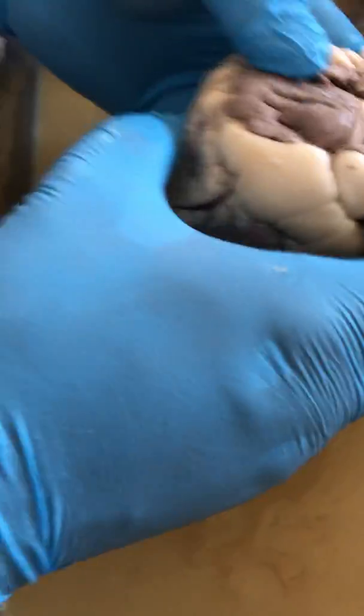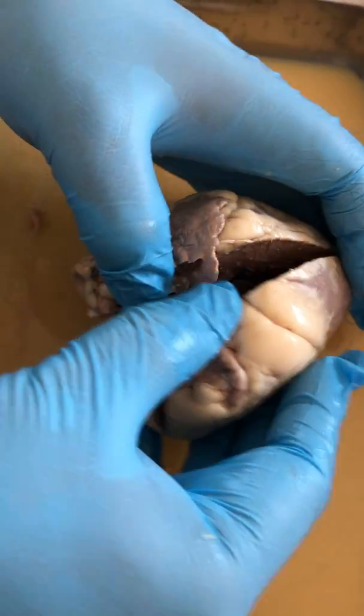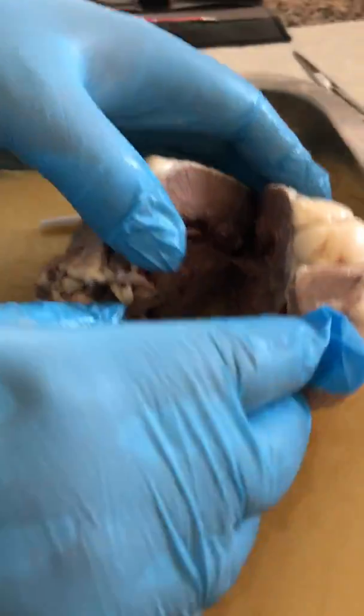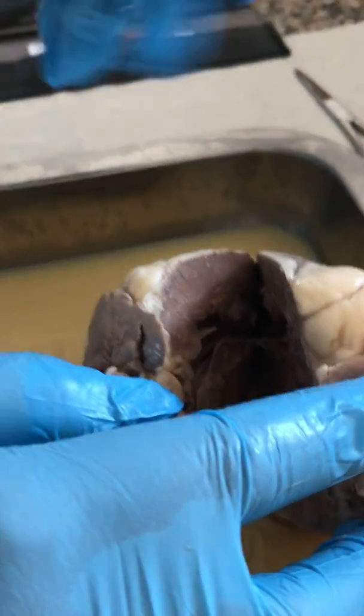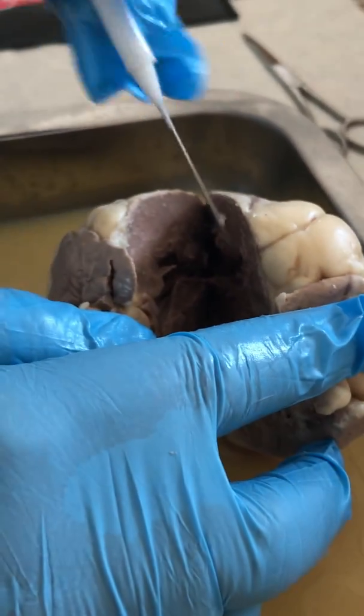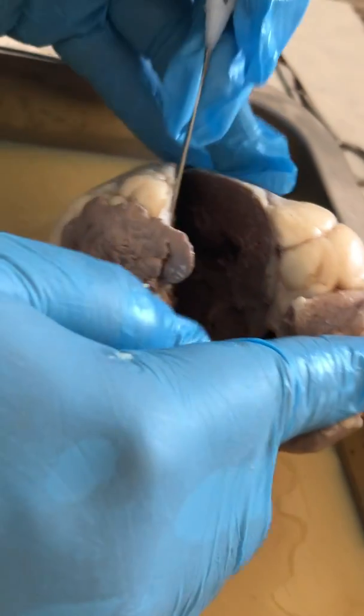Okay, opening up the heart now. I'm going to make sure I have the right ventricle and right atrium on top. This camera's kind of hard to get in there, but the myocardium is the muscular wall of the heart. So you see all this muscular tissue, that's the myocardium. The innermost layer of that muscular tissue is called the endocardium.